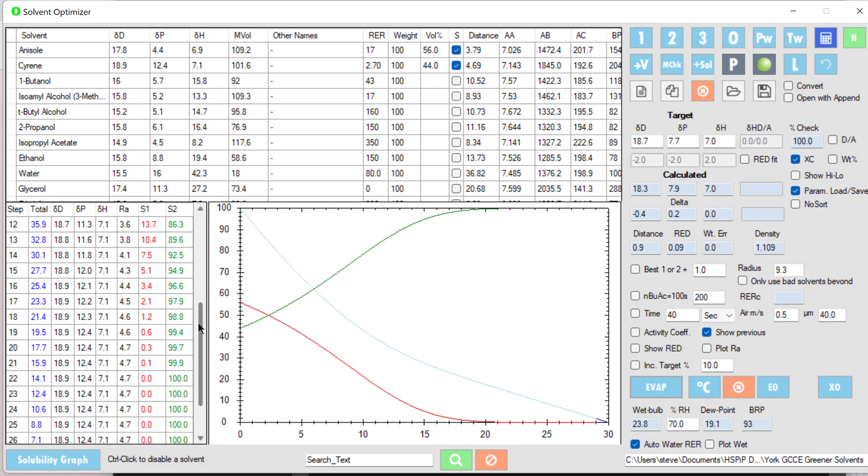So it would probably be better—this is an exercise for you to do later—to start off with a blend which has a higher initial distance but ends up with anisole being the remaining solvent because it's closer. So you can do all sorts of clever trade-offs of evaporation rate, solvent blends, and compatibility so that the polymer stays in as long as possible to give you the most relaxed and smooth coating.